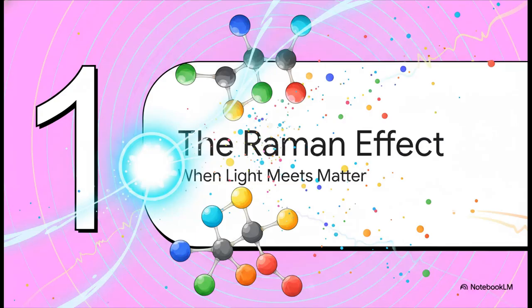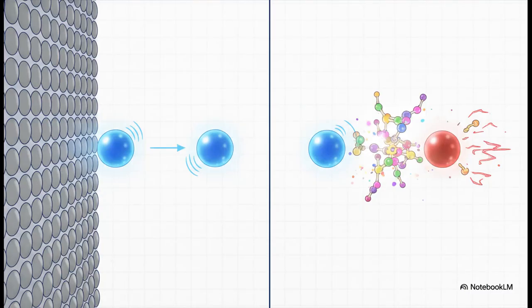Section 1. The Raman scattering effect. When light meets matter. To really kick off our journey, we have to look at what actually happens when a photon of light literally crashes into a molecule. When monochromatic light, usually from a super-focused laser, hits a sample, the vast majority of the photons just bounce off elastically. Scientists call this Rayleigh scattering. There is absolutely zero change in energy. Think of elastic Rayleigh scattering kind of like a rubber ball bouncing off a solid brick wall. The ball comes back with the exact same energy it hit the wall with.